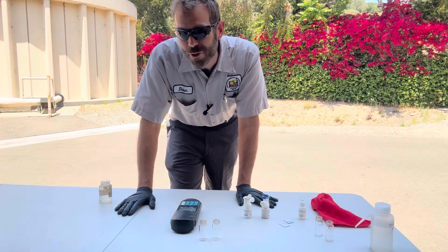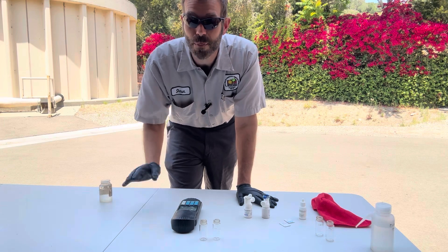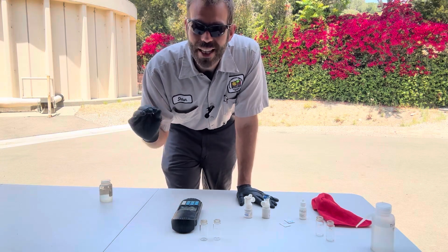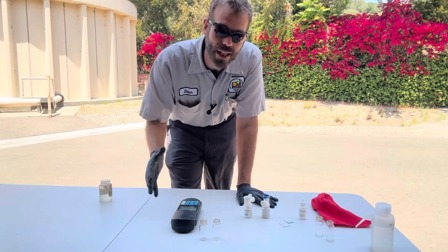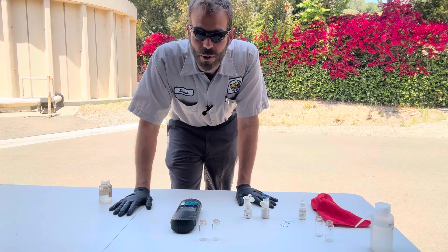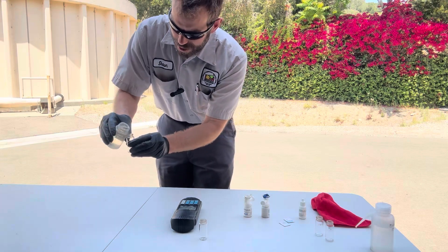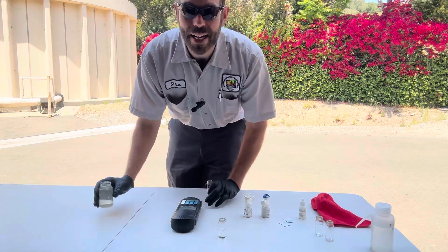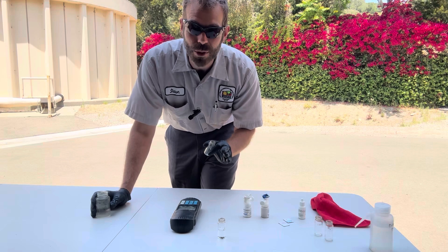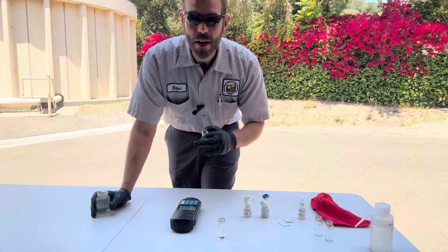I believe I'm very close to the breakpoint - there's a little free ammonia left and that's why I'm not sure what to do. Something just seemed a little off in the contact chamber based off the readings I was getting off SCADA, and some of our ORPs were giving me reads I wasn't comfortable seeing. I took a grab out of the contact chamber. Right now I've got a blended effluent - mostly MBR and a little bit of trickling filter.